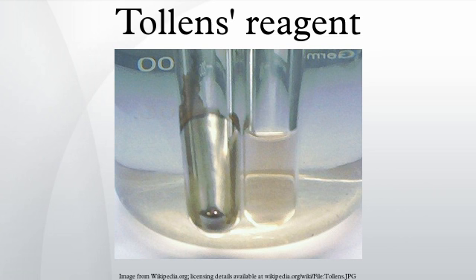Alternatively, aqueous ammonia can be added directly to silver nitrate solution. At first, ammonia will induce formation of solid silver oxide, but with additional ammonia, this solid precipitate dissolves to give a clear solution of the diamminesilver(I) complex, [Ag(NH3)2]+. Filtering the reagent before use helps to prevent false positive results.